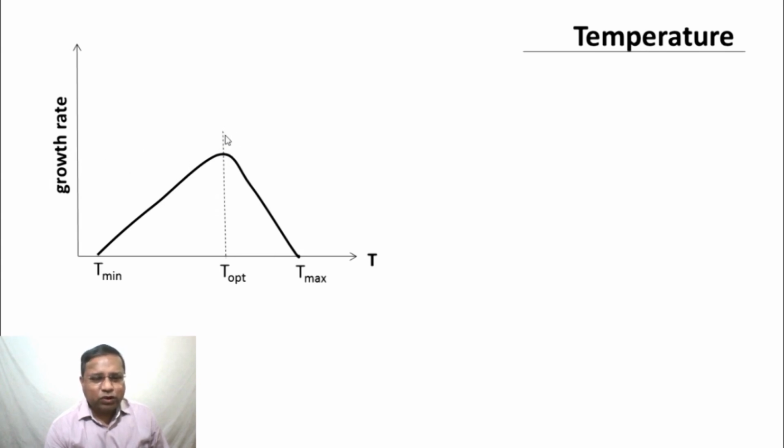And we would like to usually operate at the T optimum unless we are looking at coming up with temperature based strategies by which the temperature is varied in a narrow range towards various ends. Okay, I'll probably briefly talk to you about it, or maybe I can mention this. We have done some work on that.